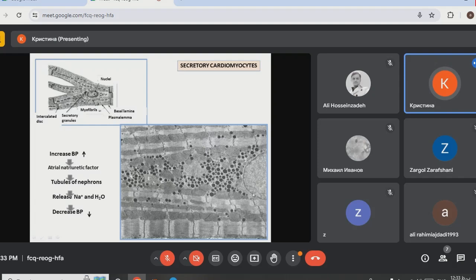So here you can see the part of the nucleus of the cell. These are myofibrils, lighter, stained with their Z lines, darker lines here. So this will be one part of the myofibril. It's a structural and functional unit, a sarcomere. Between myofibrils you see darker mitochondria. You have here a lot of mitochondria connected together.